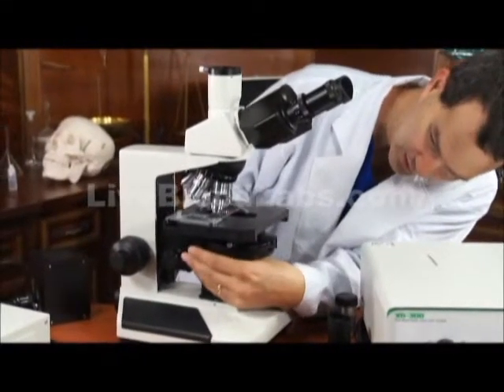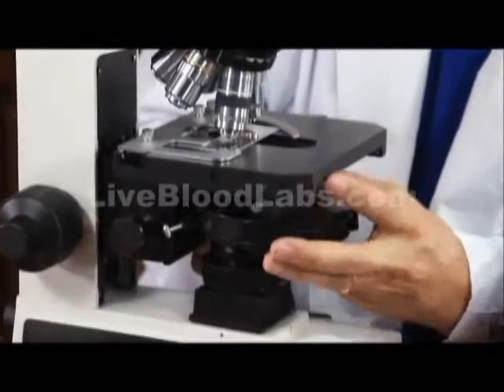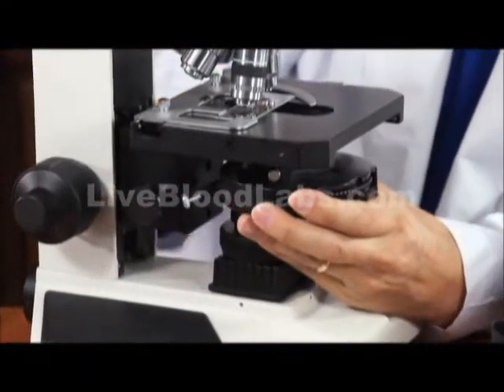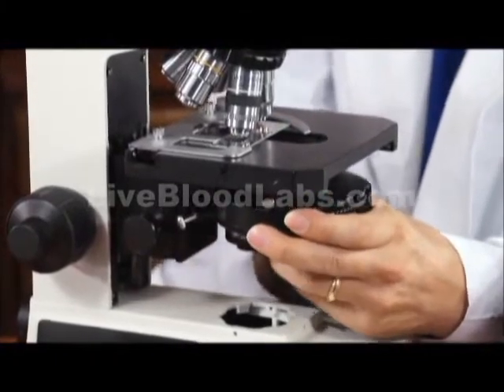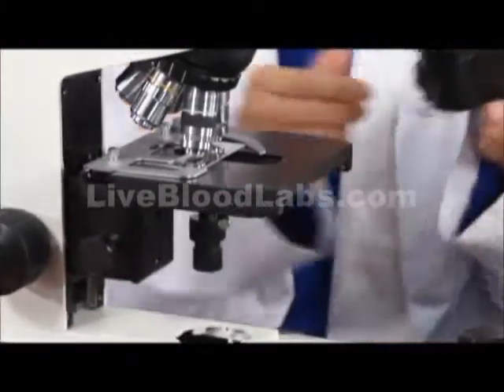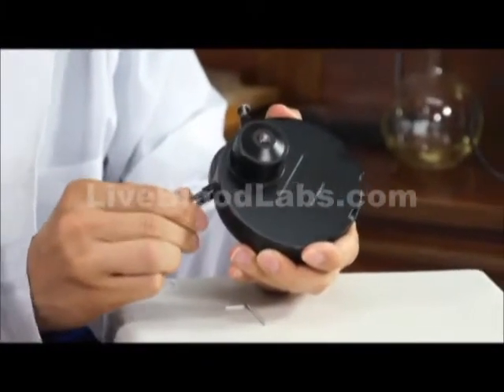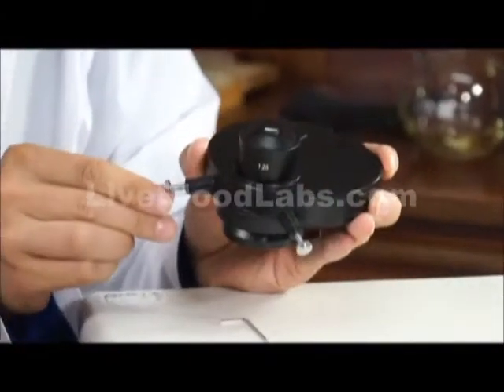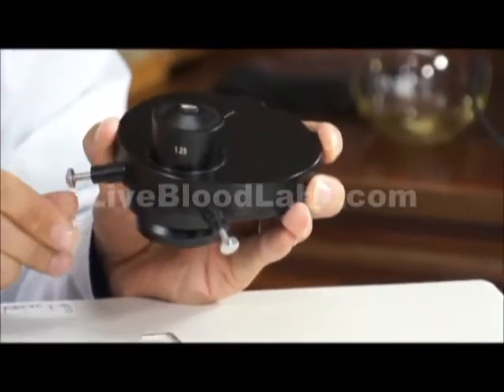These knobs in the back — let me take this off — these knobs are used to center. You push them in and you turn them, then let them back out. Push it in, turn it to center it, and let it back out.